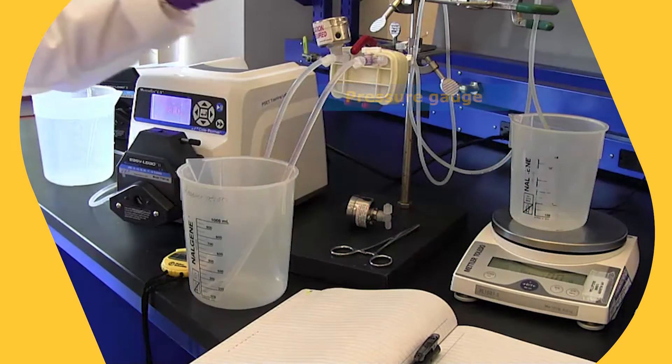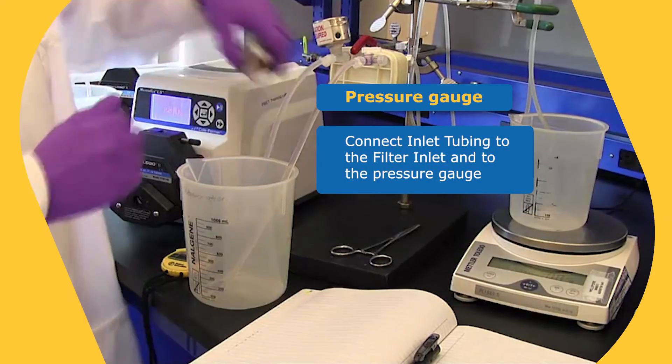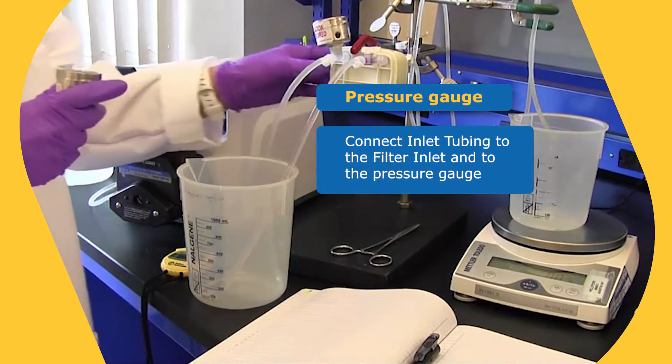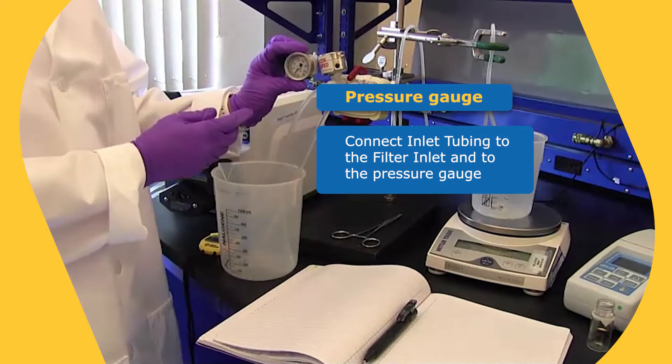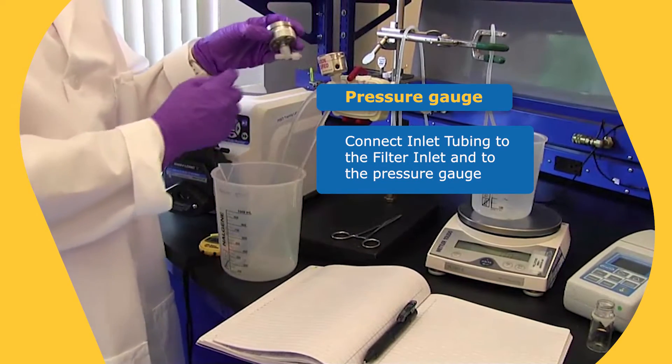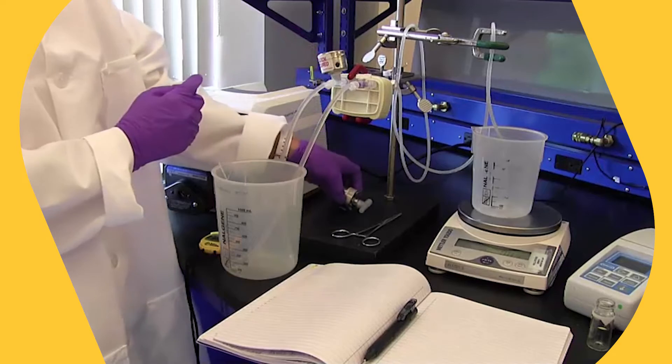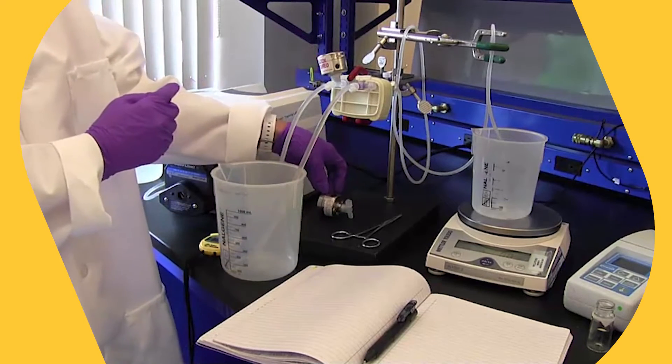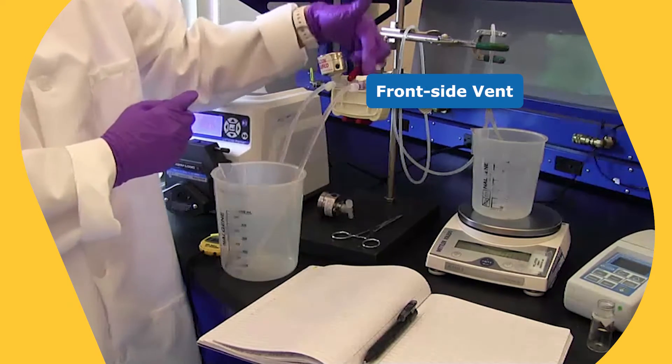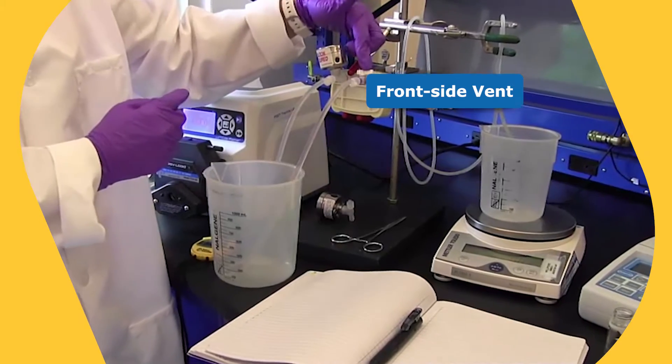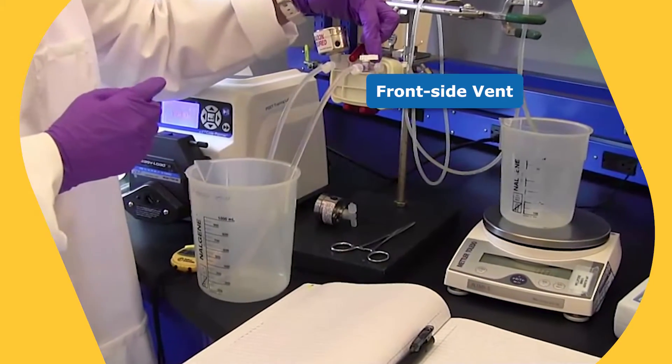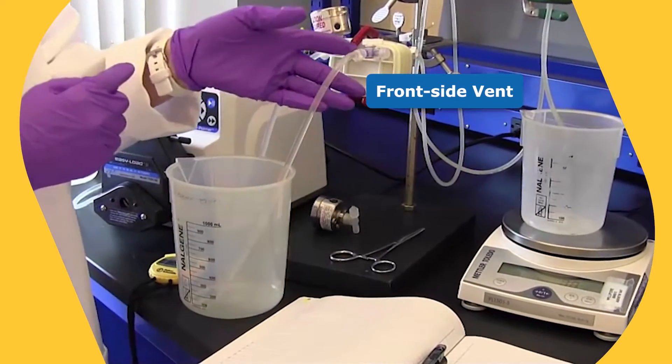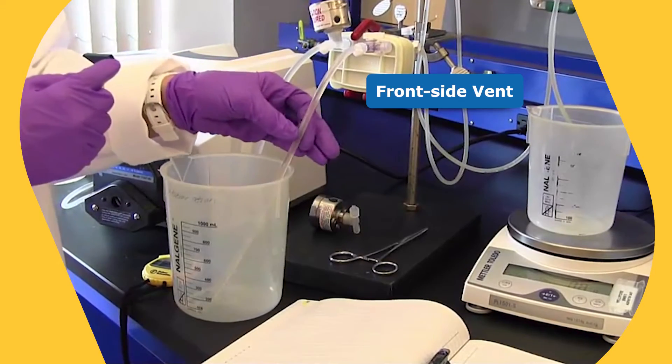So then we also have a pressure gauge here, which is connecting the inlet tubing to the inlet of the filter. So you see you would have your pressure gauge. This is connected to the filter using a lure T. Also on the front side of the filter is the vent. So here we have a three-way lure valve. You can use a two-way lure valve. You could actually just connect the tubing directly to the filter and use some type of clamp.